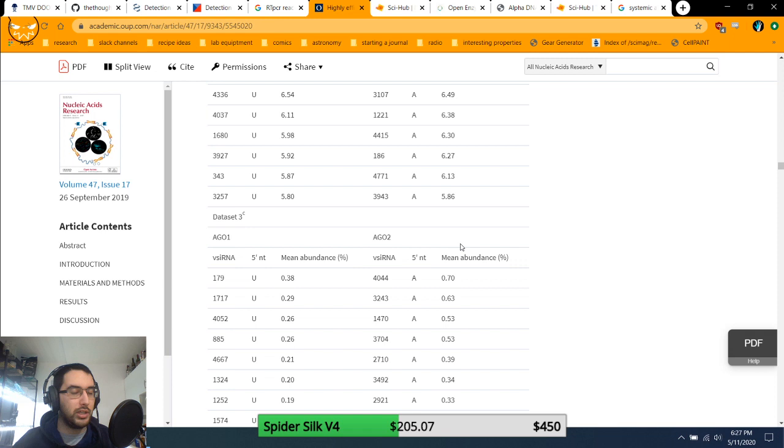So this is a very effective way of getting DNA or RNA or whatever into plants. But I don't have Agrobacterium. I don't want to work with Agrobacterium. I don't want to be spraying my whole house down with Agrobacterium, because that sounds like a really dumb idea. So instead, I'm going to basically try and do this, and also, there's a pandemic, so getting access to materials is really hard right now. So I'm just trying to use what I've got. So here's my plan.